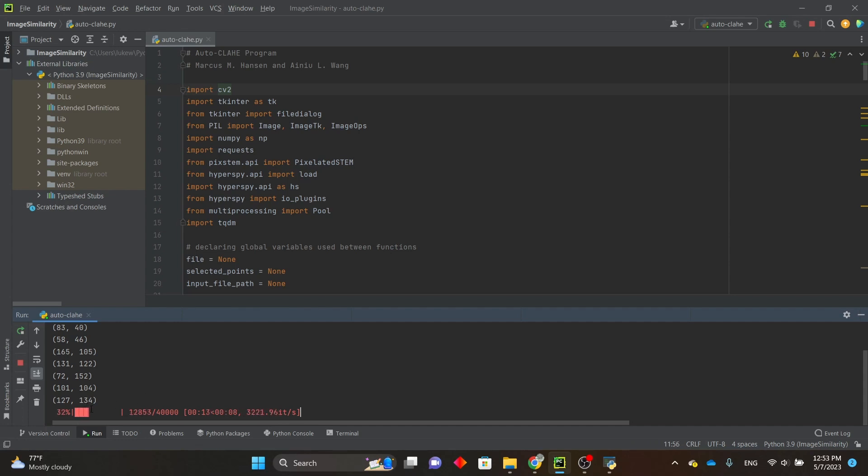For my computer, it only takes a few seconds, but the filtering time may depend on the specs of your own computer.